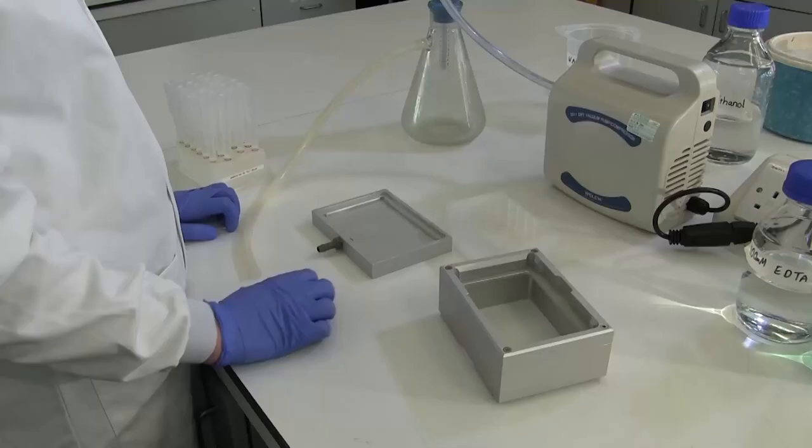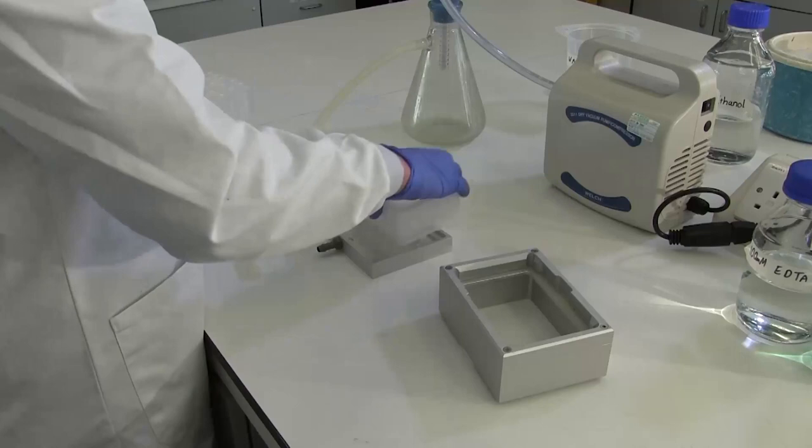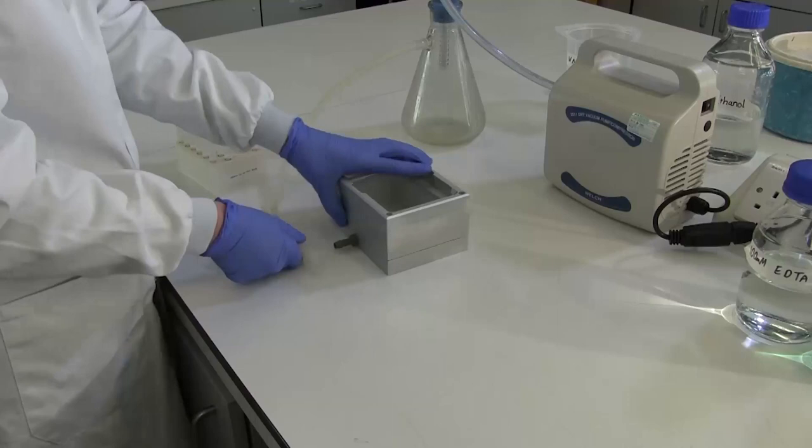Place an open collection plate in the base of the manifold and close with the top of the manifold. Attach tubing and place the assembled MCPA with columns on the top.